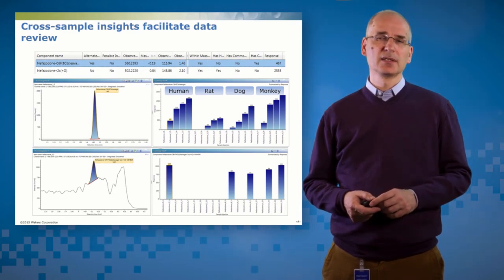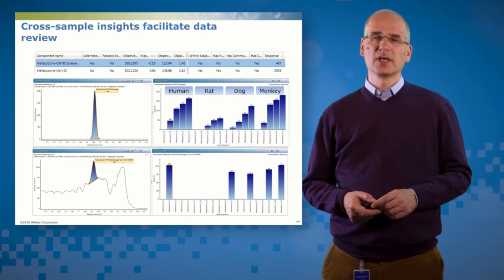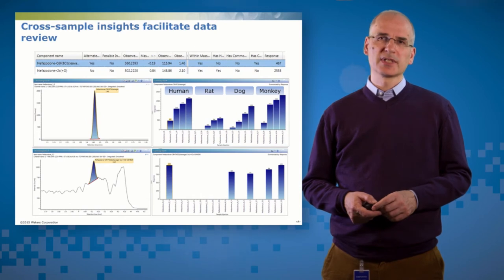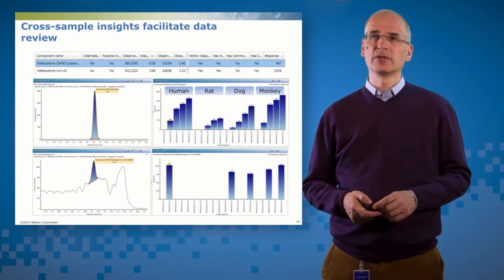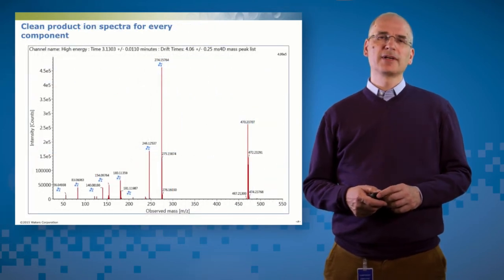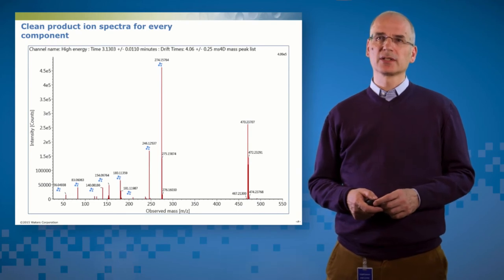Here's another component, not in the table, but just one I've randomly selected. And you can see the chromatogram. But now you can see in the trend plot, there's no time dependency and no species dependency for this component. So that suggests it's a false positive and it's actually not real at all.